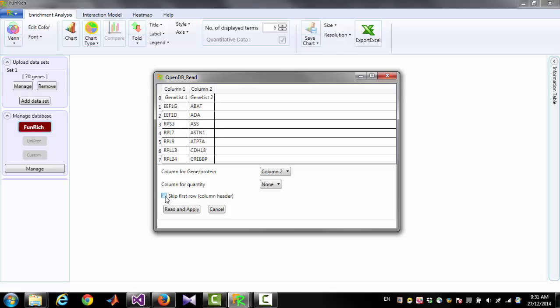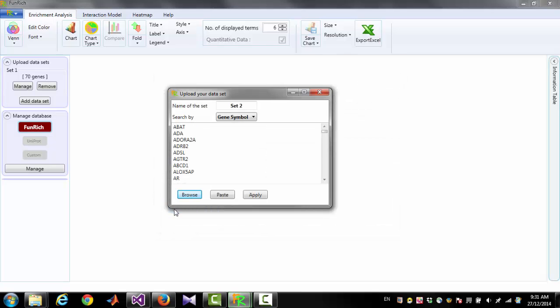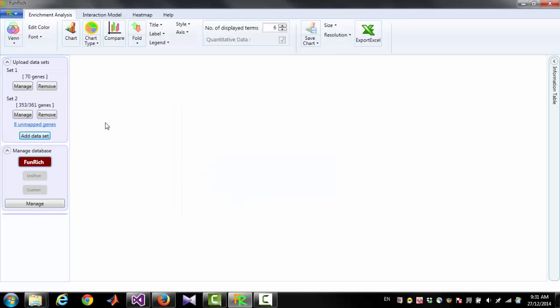Then you have to select the checkbox 'Skip the first row' when your column has a header. Then click Read and Apply. This will take all the genes from column 2. Then you click Apply and you will get a new data set.